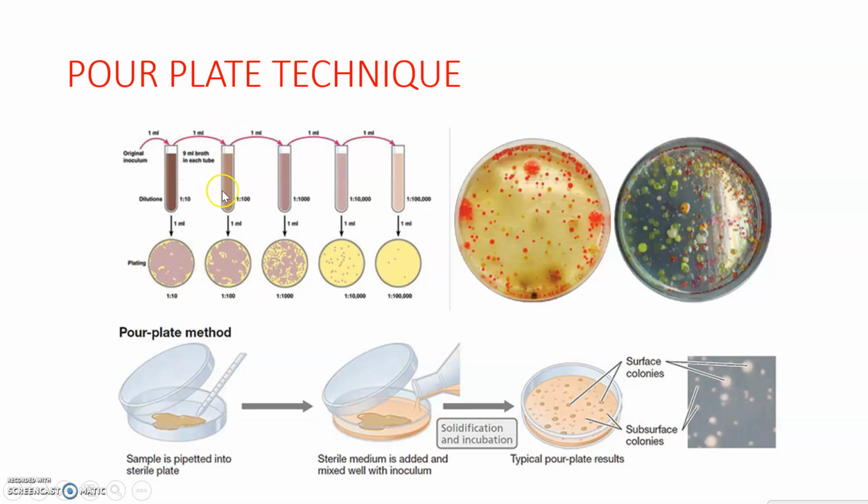Then in the second dilution, what happens? The diluent increases. Dilution is more in this case, so the organism is also less. Comparing to this, we get separated colonies. From this, it is very thick. Then when we are plating into another, like that, now individual colonies can appear in the final dilutions, according to 1:100,000.